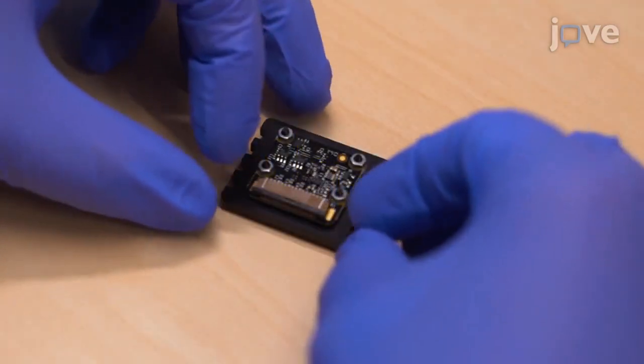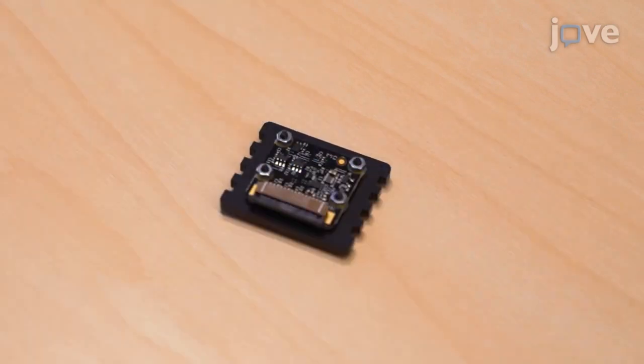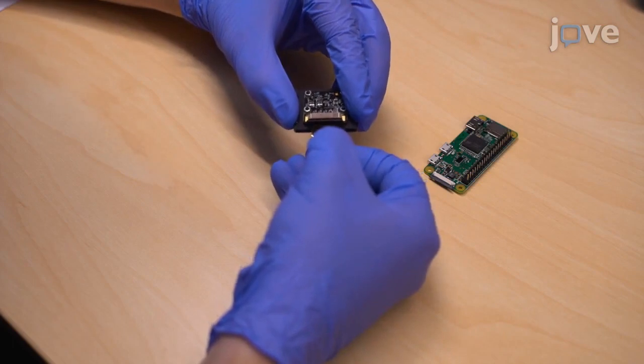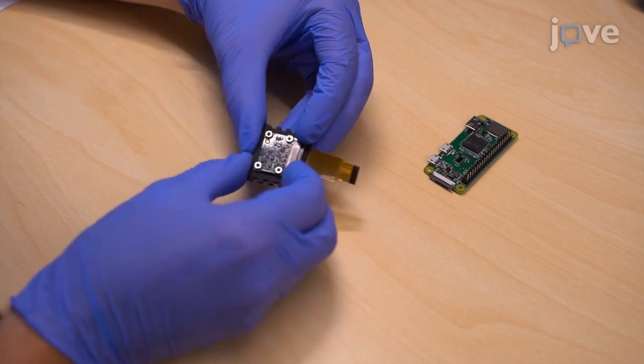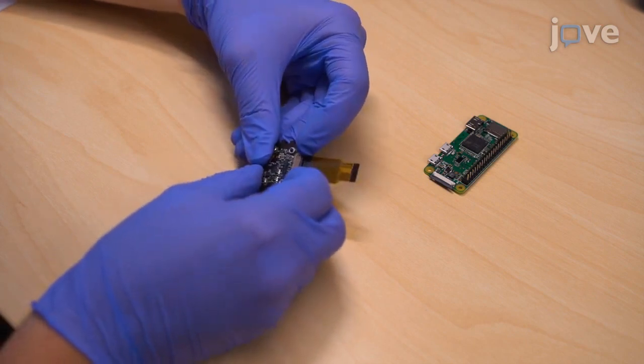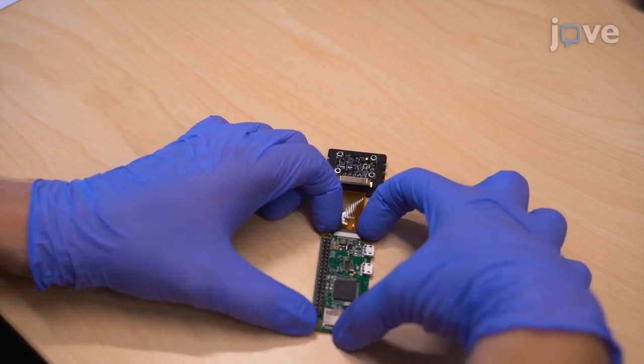Open the ribbon cable ports on the camera module and microcomputer by gently pulling on the edges of their plastic clips. Place the ribbon cable in the open port on the camera module so that the cable's silver connectors face the circuit board. Then, lock it in place by pushing in the plastic clip. Repeat the process with the port on the microcomputer.